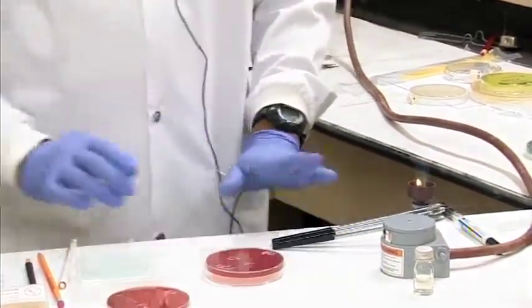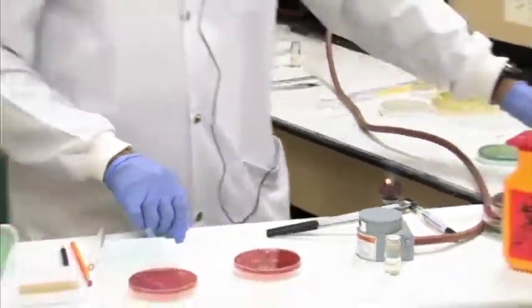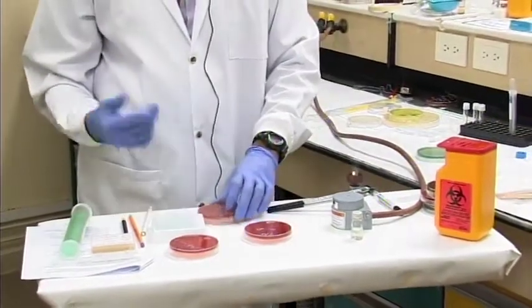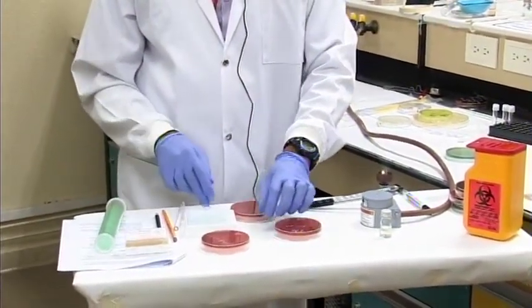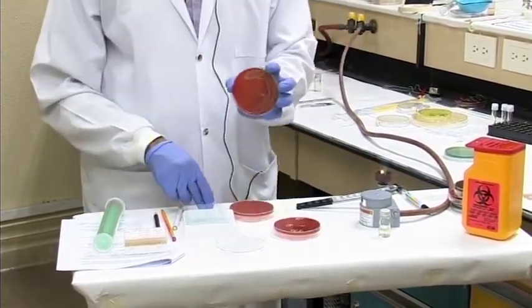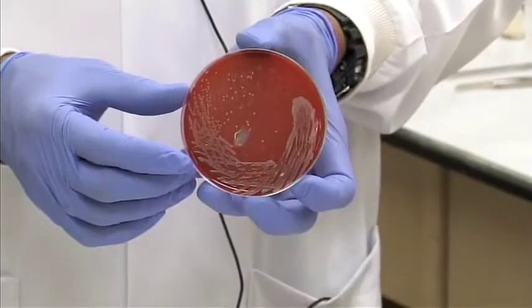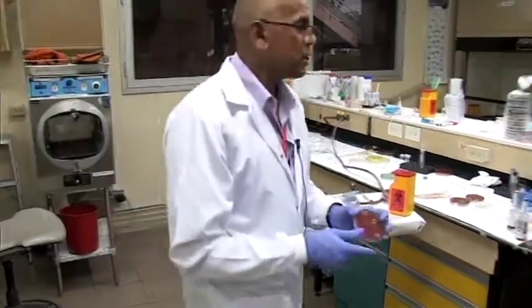So that is using your loops to streak a plate. Now, there are different varieties of streaking method, many different techniques one can use, but the main thing you want to do is try to streak to achieve the end product like this. So this is our streak plate. We're going to place it in the incubator.